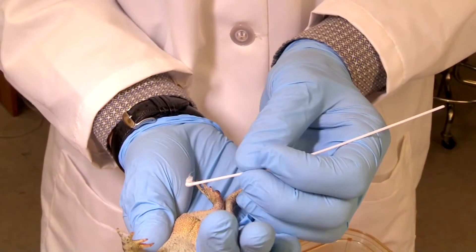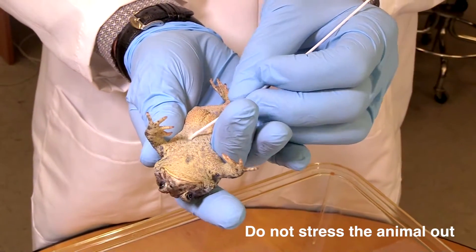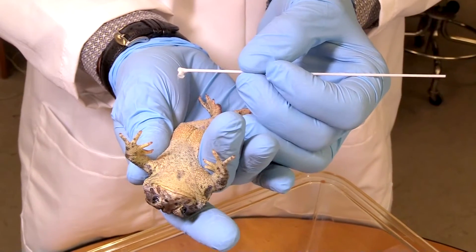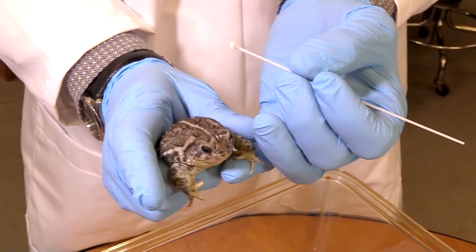Also notice the animal is not distressed. You do it hard enough to get some friction on there because you're breaking little skin cells off, but you don't do it so hard that you hurt the animal or stress out the animal.